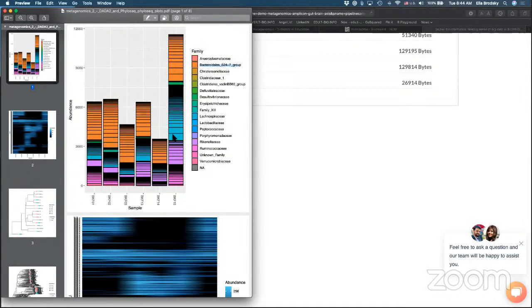The second one is this green one, right? As we look at this plot, it is a little bit difficult to understand what exactly the proportions are. It gives us a quick snapshot of how to compare them, but it doesn't necessarily provide a very clear understanding of what we want to get out of this type of information.